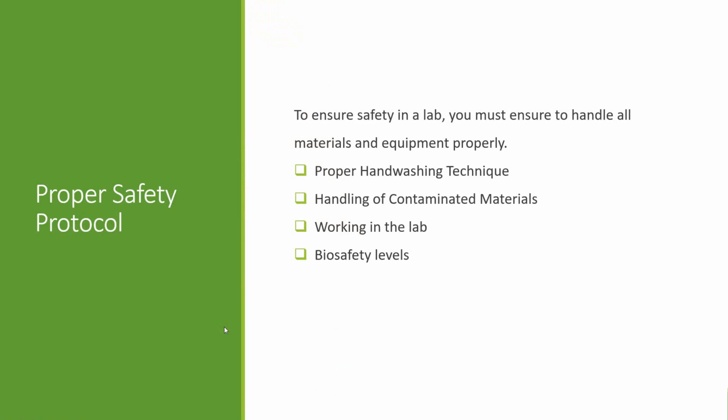So when you are here doing what we call a wet lab, a lot of the techniques and a lot of the principles that you learn in a wet lab will apply to the clinical settings or to future classes.